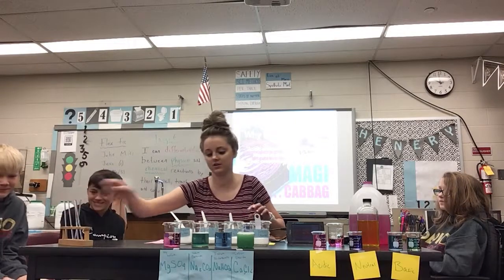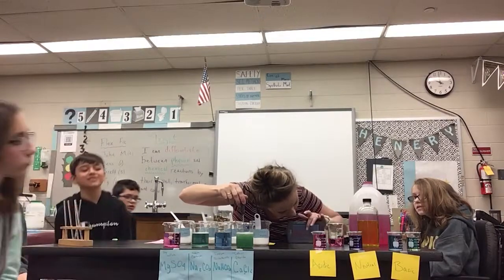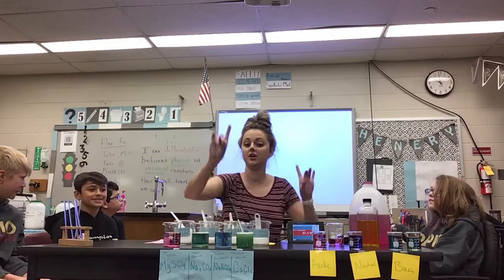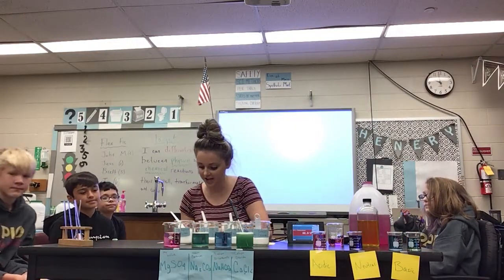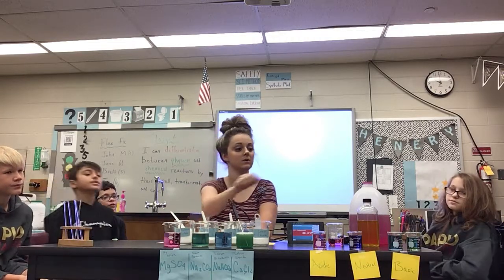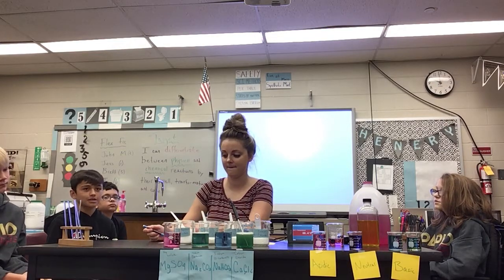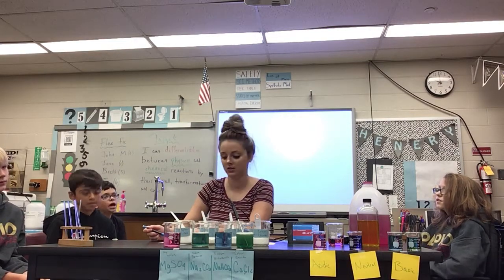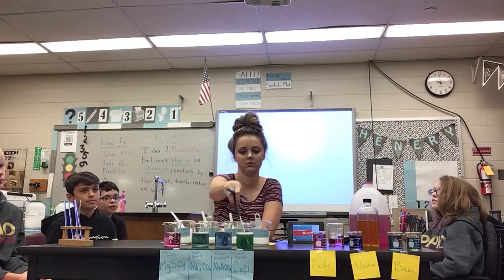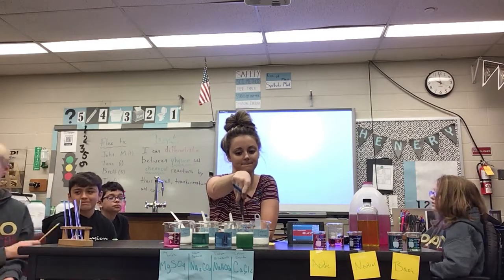So now let's stay focused, guys. Okay, let's take a look at this. Oh my goodness. Whoa. Like 80. While that goes up, color change? Yes. What is it? It's still basic. Precipitate? No. Evidence of chemical change? Yes. Degree change. 88.4. Yeah. Well, that's hot. That's pretty warm. That's not hot. That's just like toasty.